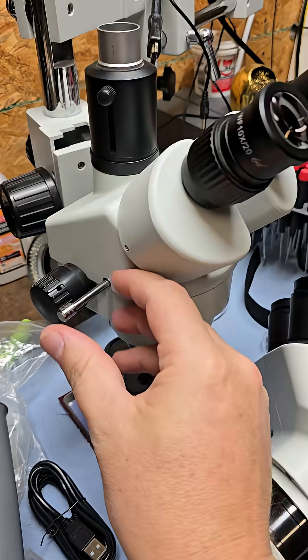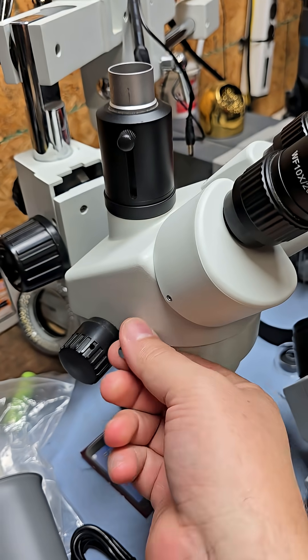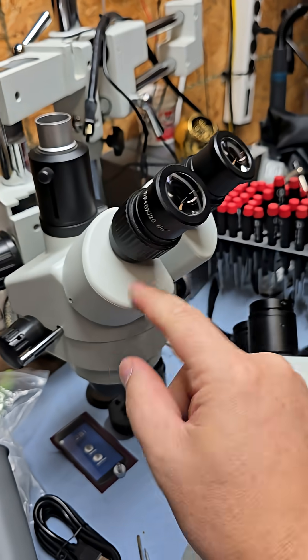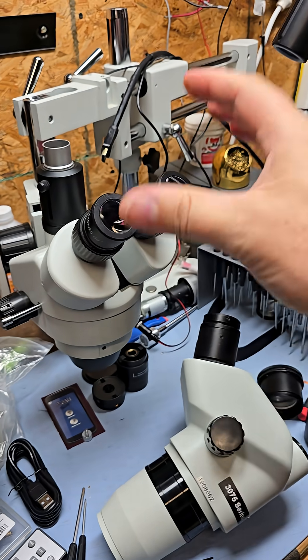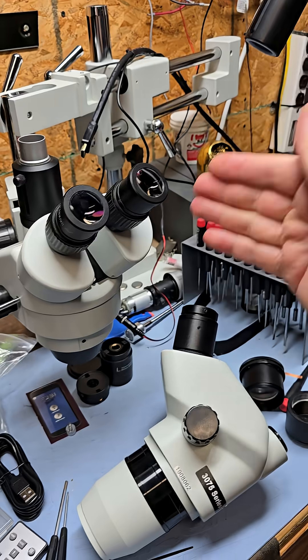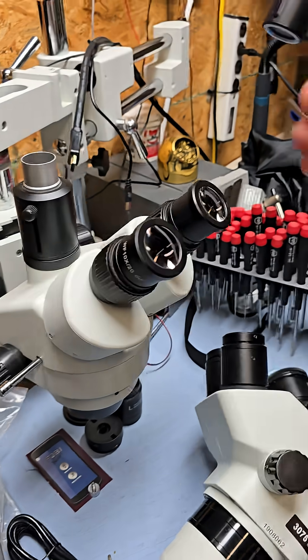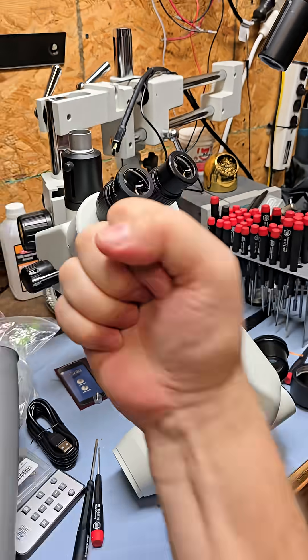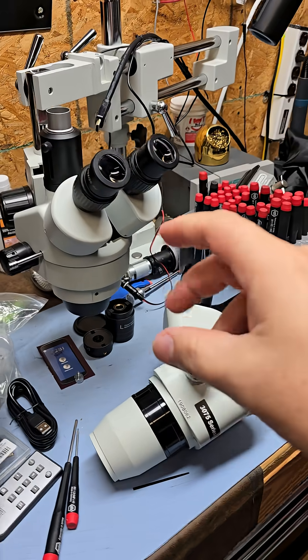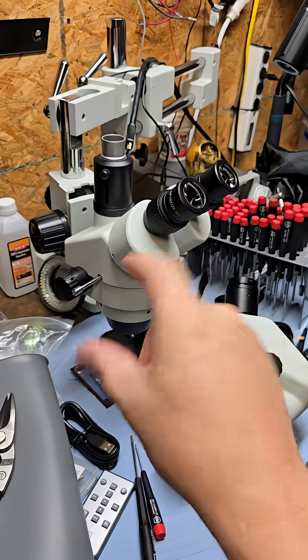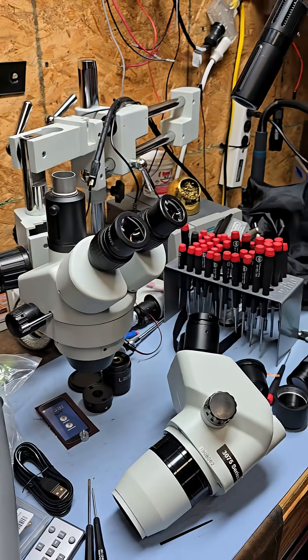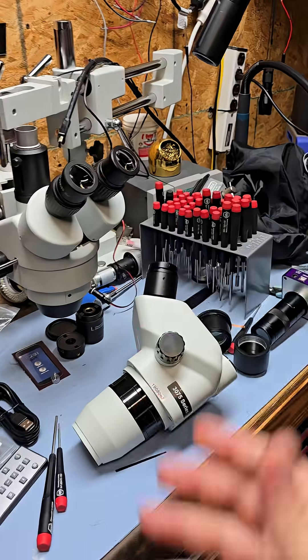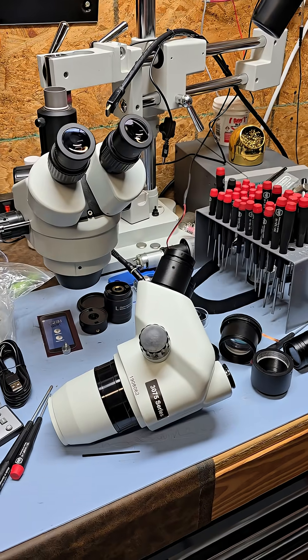And also you see this little dingle hopper hanging out right here. That is because it shuts off light to one of the oculars. So now I go from stereo to mono in order for me to have a camera. AmScope. So I need a particular one that has the ability to share both, but guys, that's my frustration.